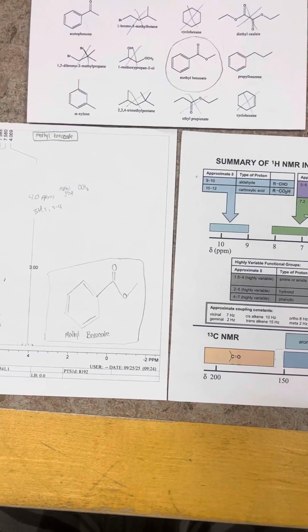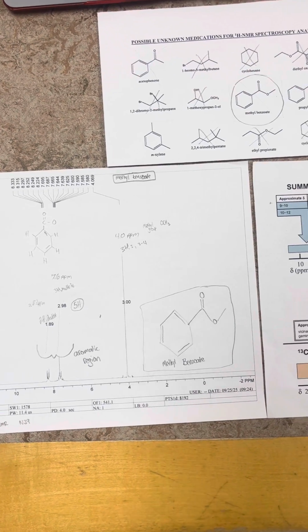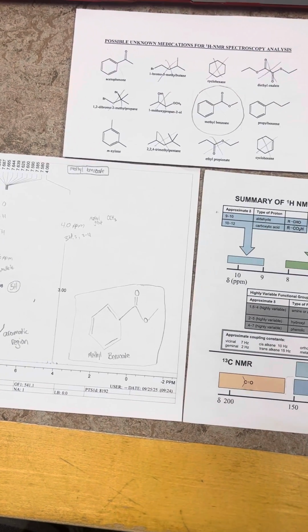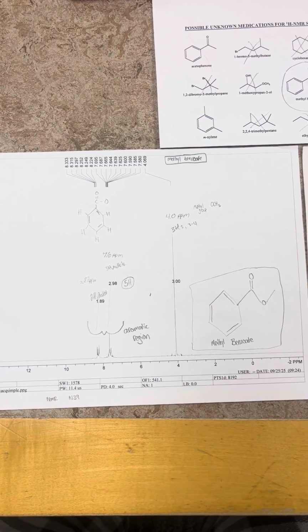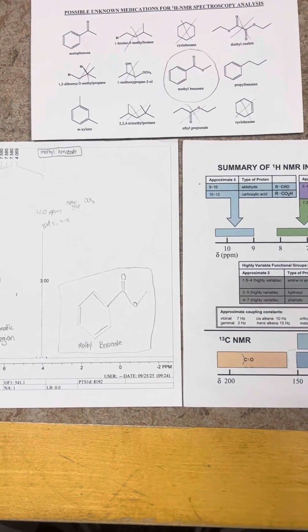Experimental procedure. I recorded a proton nuclear magnetic resonance spectrum of an unknown sample. The sample was dissolved in deuterated chloroform, CDCl3, and measured at room temperature.